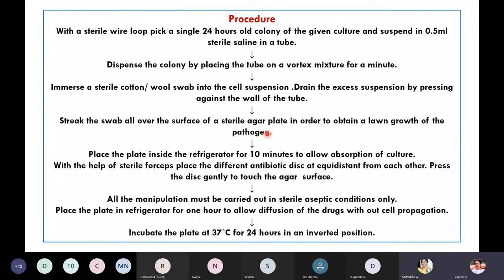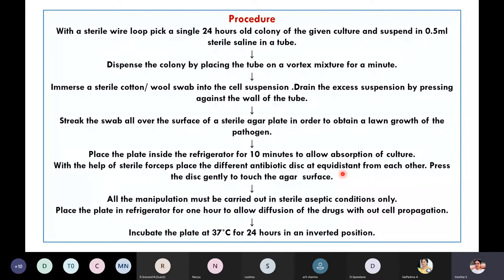After preparing the lawn, place the plate inside the refrigerator for 10 minutes to allow absorption of the culture onto the plate. Now, with the help of sterile forceps, place the different antibiotic discs at equal distances from each other on the plate.